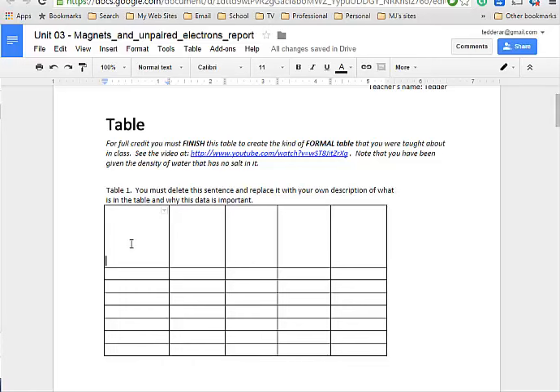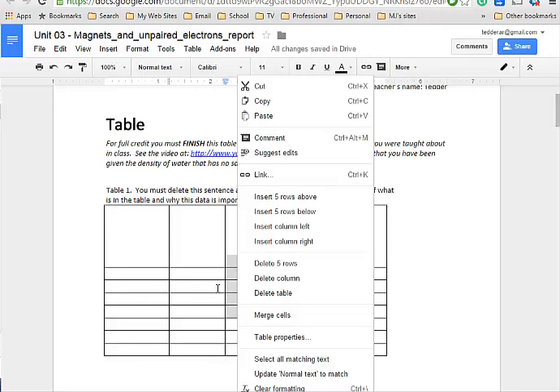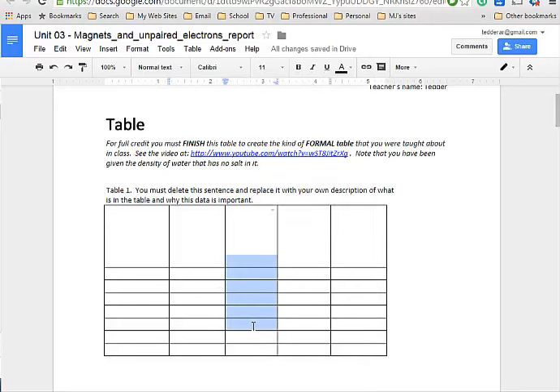All right, column labels. Make sure you label columns, and if there are measurements or calculated numbers in that column, you list in parentheses what the units of measurement are. In column number 1, you might want to put the name of the chemicals, so the column label might just be the name of the ion or the symbol for the ion. Column number 2, well, you're going to need to have your mass listed somewhere. That'd be a perfectly good place for column 2: mass change for the testing of these ions. And column number 3 might be the force that you calculated. So you've done 6 calculations. You might put those in this column.